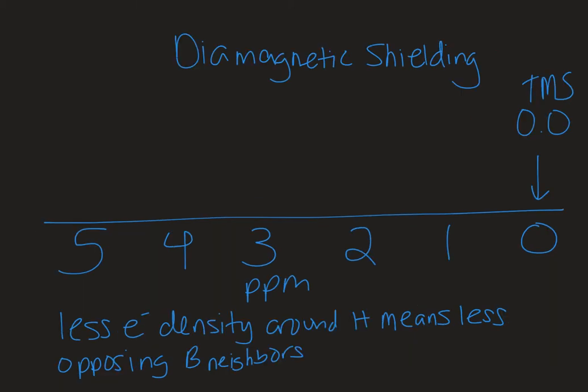I've zoomed in on the top part of the proton NMR spectrum here, between 0 and 5 parts per million. This part is predominantly influenced by diamagnetic shielding, which is essentially how much electron density is around any given proton, basically through the environment of the sigma bonds that are around that particular proton. We're looking at all H's that are on carbons that are sp3 hybridized. Remember in the proton NMR the only signal you're seeing is from a proton, but the atoms that are attached to it and next door to it are going to be influencing where exactly that chemical shift occurs.